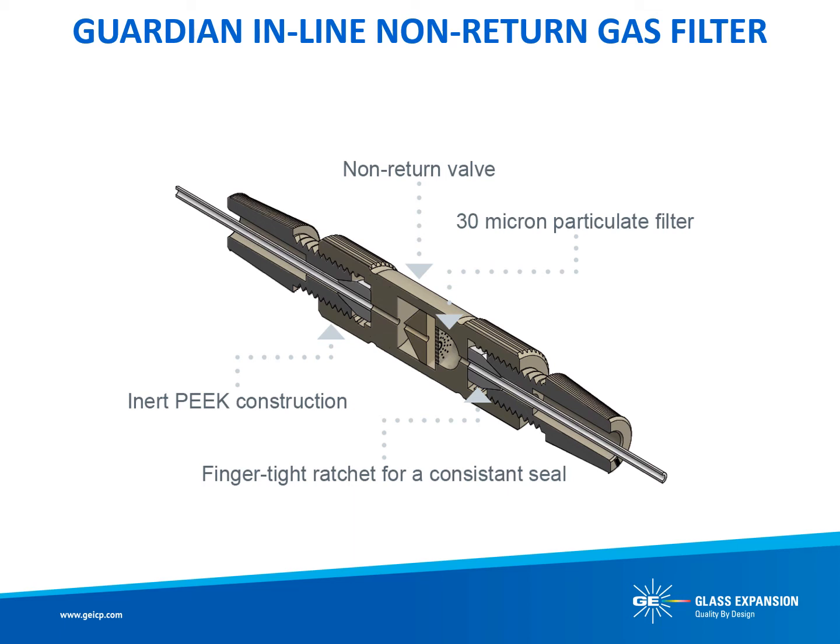Siphoning of the sample or rinse solution into the nebulizer argon control module on your ICP can occur at the end of a run when the nebulizer gas pressure is turned off and there is still liquid in the sample flow path. It is made worse if the autosampler probe stays in the rinse position at the end of a run. It is a real problem when using an autosampler for unattended overnight runs, a silent, invisible killer of your ICP. Acidified solution in the instrument argon control module can cause corrosion to electronic sensors and mass flow controllers and damage regulators that can result in expensive repairs to your ICP and unplanned downtime.